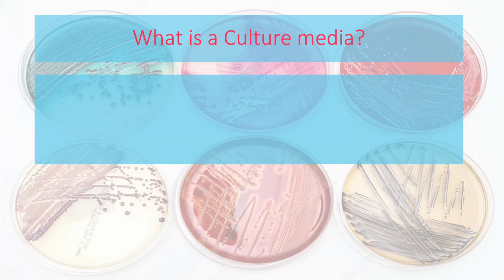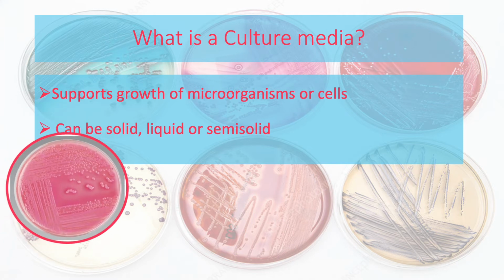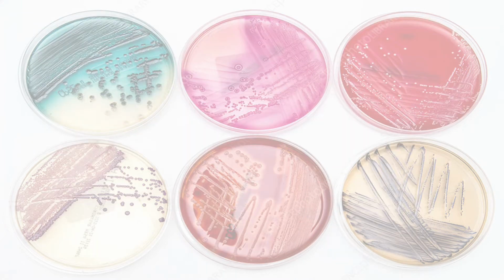So as we go ahead, we have this question: what is a culture media? A culture media, which is also known as the growth media, is designed to support growth of microorganisms or cells via the process of cell proliferation. I like to think of it as food for bacterial cells. It can be present in three physical states: the solid, which is the agar plates; liquid, which is the nutrient broth in a test tube; and semi-solid.